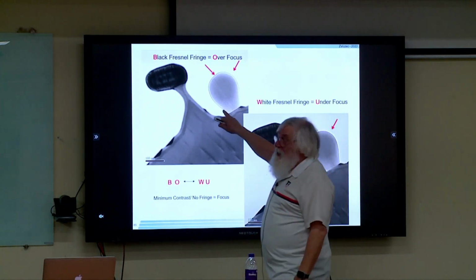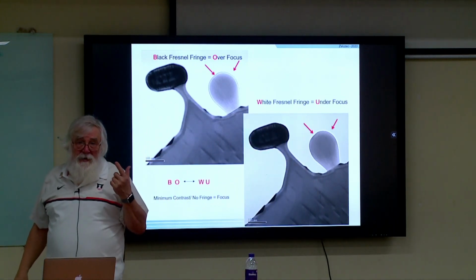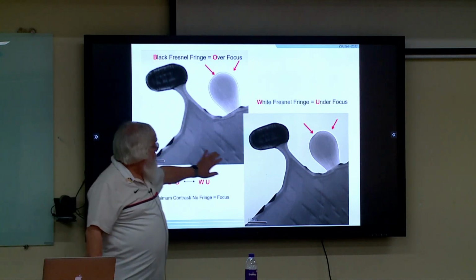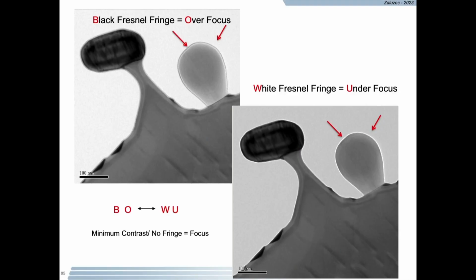This is easier to see. Your eye likes it. Your eye likes contrast. Your mind likes contrast. But that's a bad mode to generally run in. You generally want to be either under focus or at focus, and most times slightly under focus is always better.